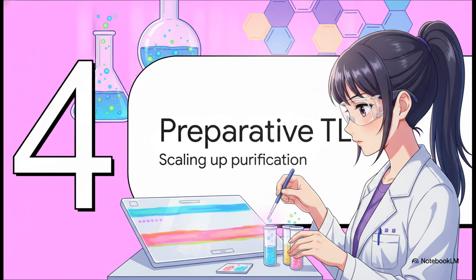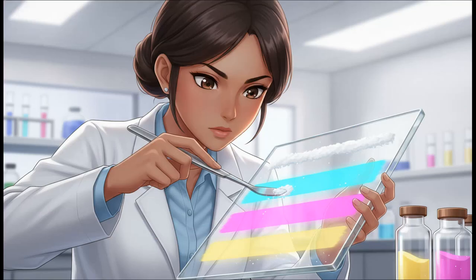Section 4. Preparative TLC, scaling up for purification. Up to this point, we've only been talking about looking at tiny amounts of molecules. But what if you actually want to keep them? What if you need to isolate a pure compound for a totally different experiment? That's what preparative TLC is for.